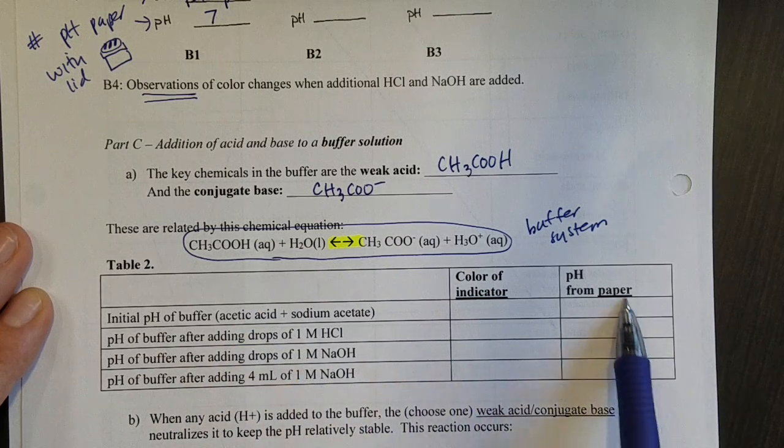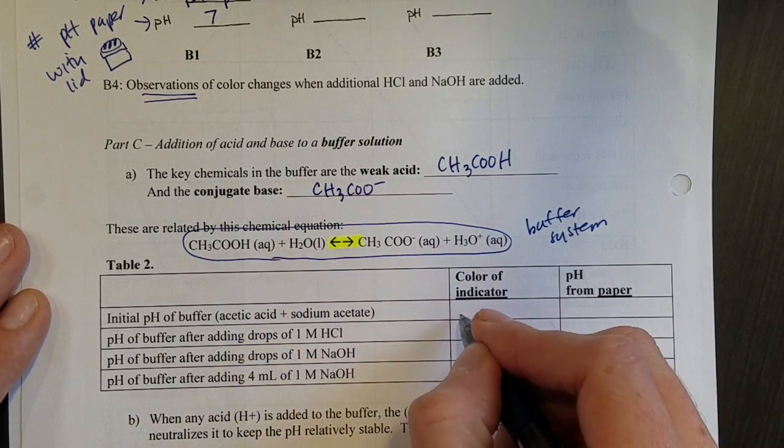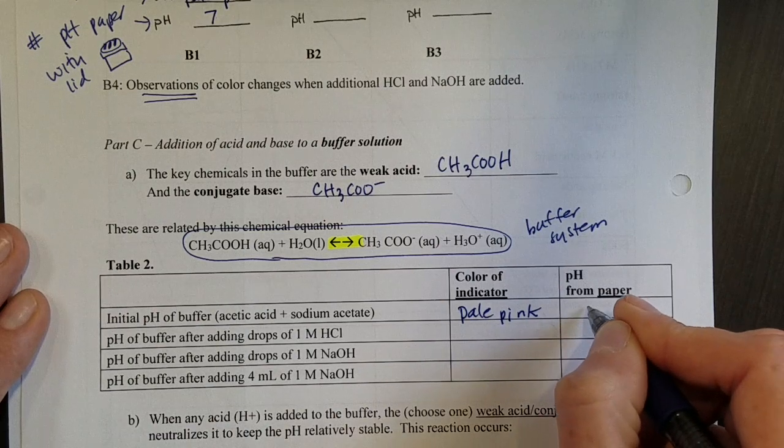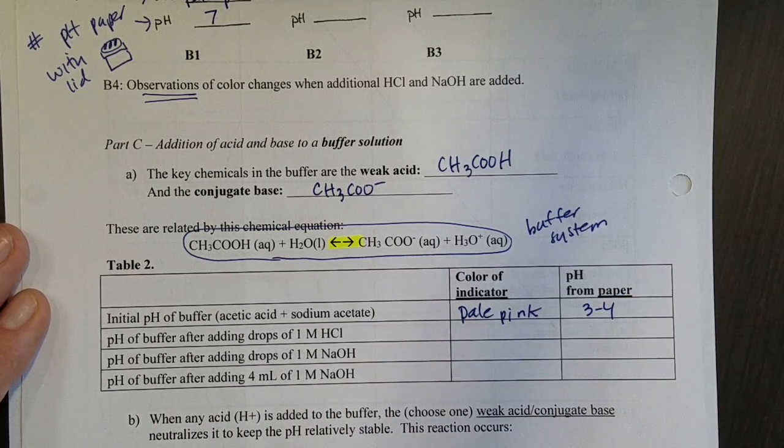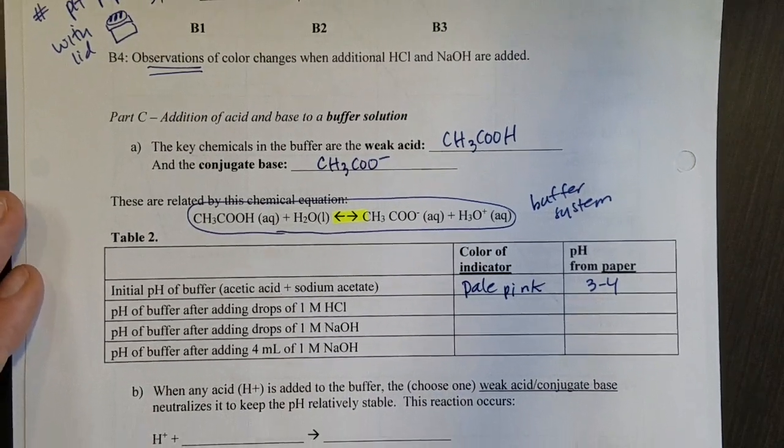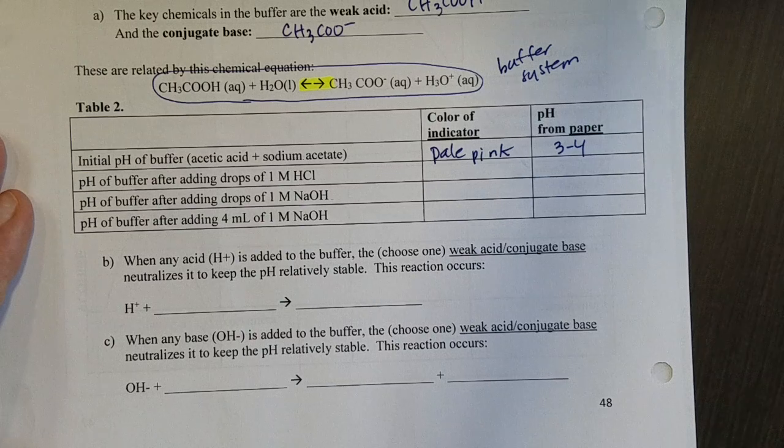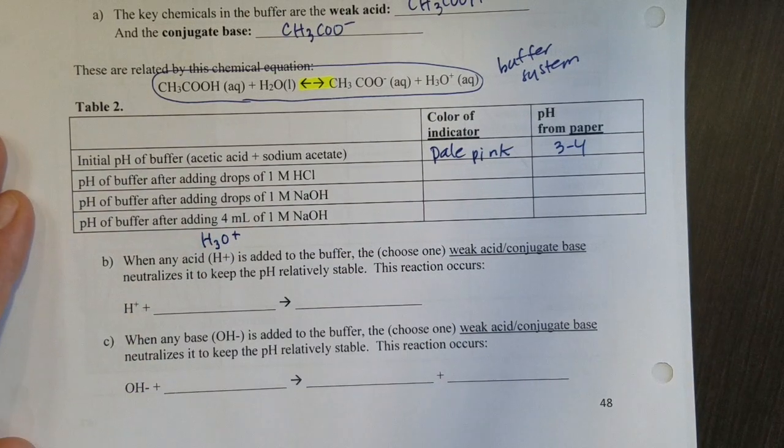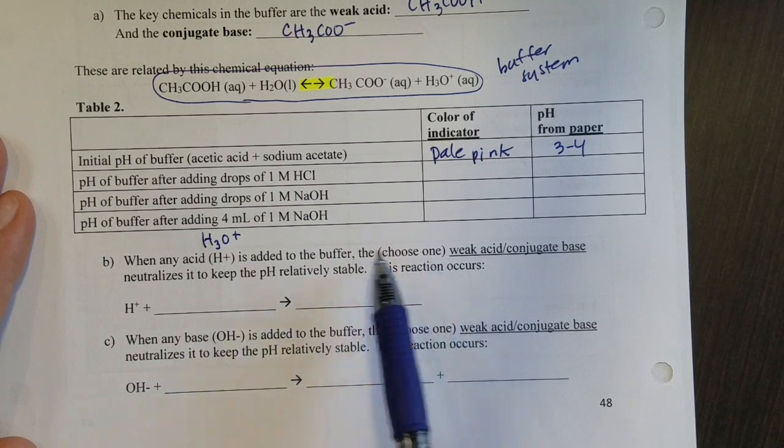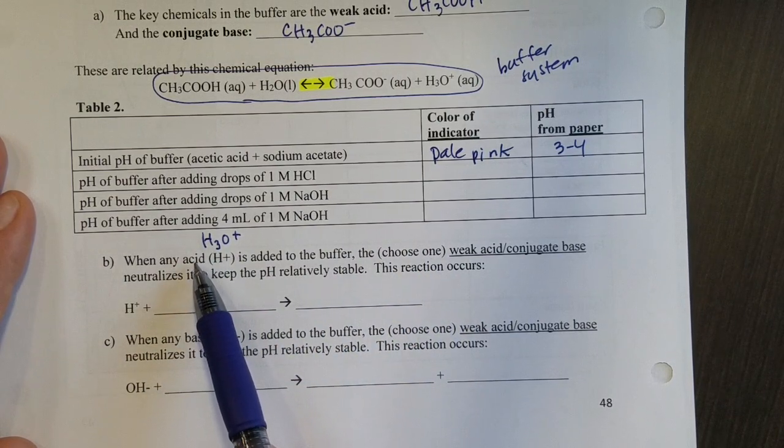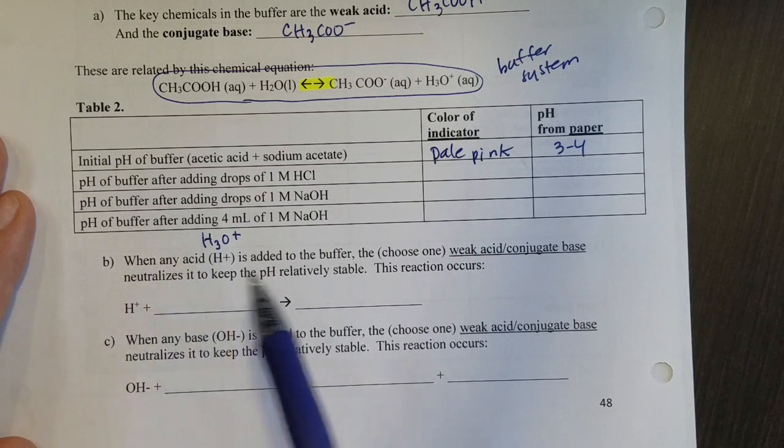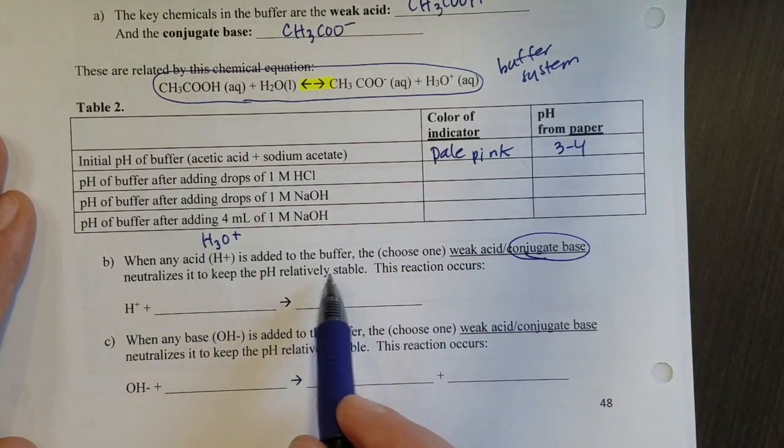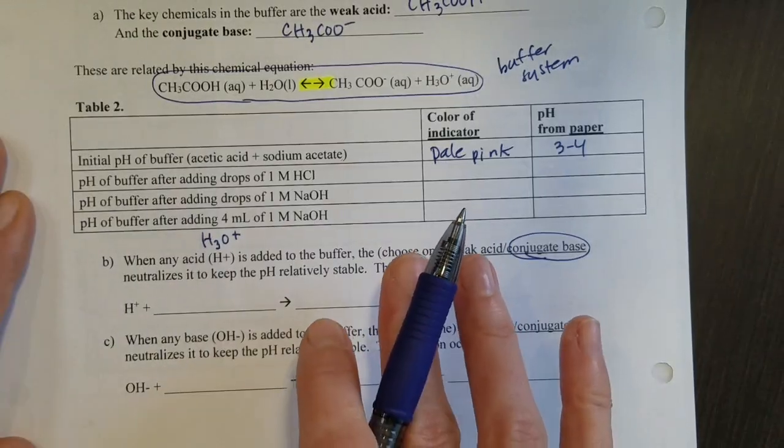So all of this data here you're going to collect from watching the video. Again here we want the color of the indicator or of the solution so that might be a pale pink here and the pH I think you'll see is right around three to four so a number here and a color here. So you'll take those observations but I want you to think here about what's happening in the buffer. So when any acid H+ or we could substitute for H+ H3O+ because those are used interchangeably we want to think about what's going to neutralize an acid that's added. So opposites neutralize each other so if I have an acid it's going to get neutralized by the conjugate base and that's what keeps the pH relatively stable.